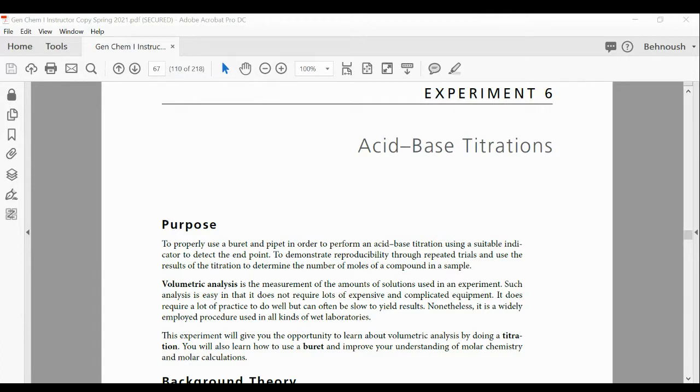So it's quantitative chemical analysis to determine the concentration of an analyte to be identified. That analyte could be an acid or a base. In titration, you always have a given and something you're looking for. It's a way of looking at the quantitative analysis that will help you solve a lot of problems. In the titration, when you have an acid and a base, which one is considered given and which one is looking for? The one with known concentration. So the solution with the known concentration is considered, in general, the given when you are thinking about problem solving.